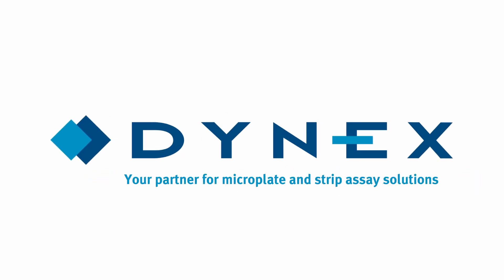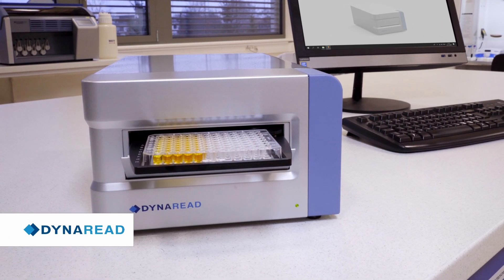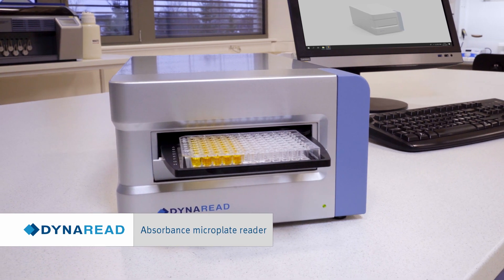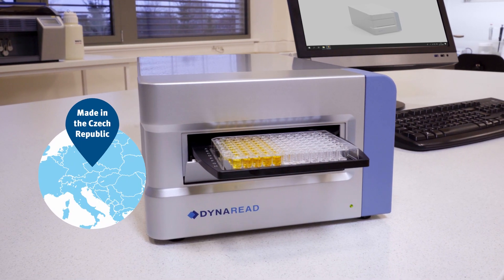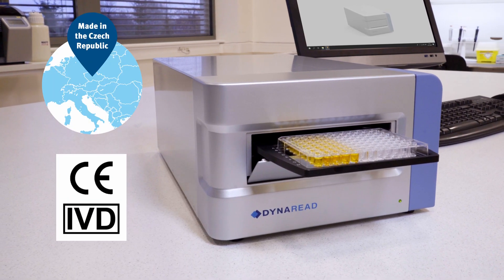Dynex, your partner for microplate and strip assay solutions. DynaRead is an absorbance microplate reader. The European origin assures high quality with a great cost and benefit ratio.